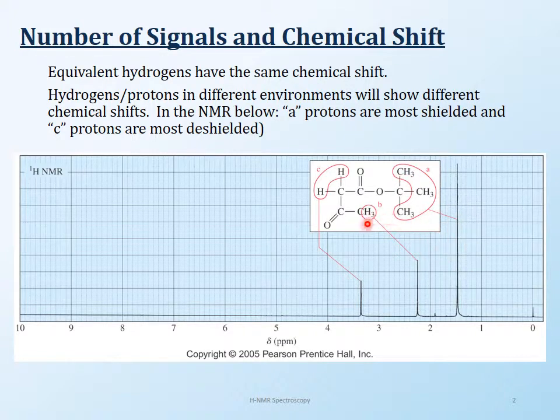And then the CH3 here is next to the carbonyl, so it comes traditionally at around 2.2, 2.3, which is right here. So here you can see clearly that you have three environments, and then you can clearly see the shielding and de-shielding going on in one simple NMR.